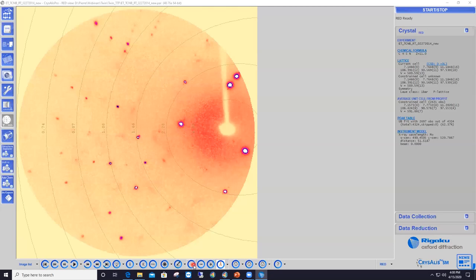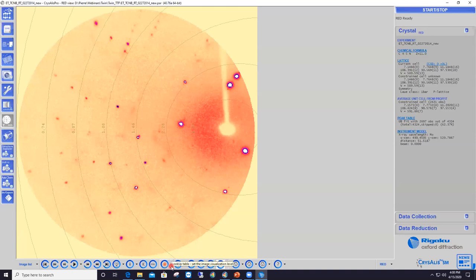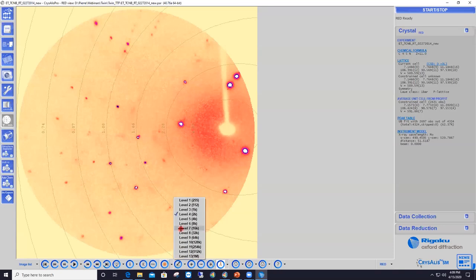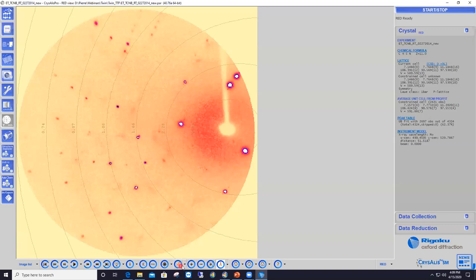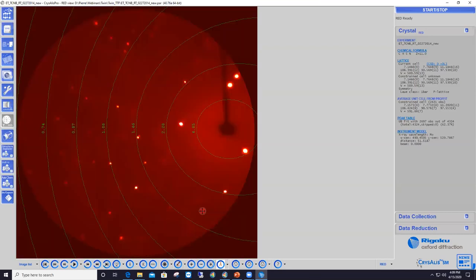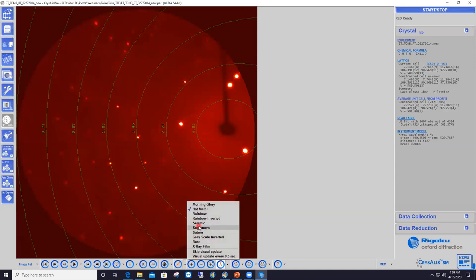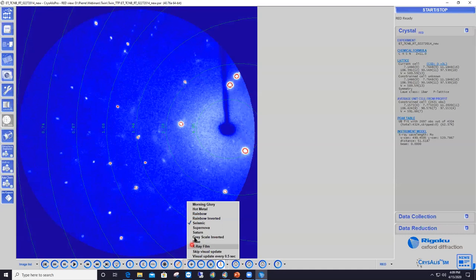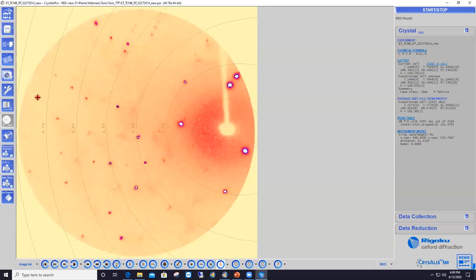You may want to adjust the zoom level using the plus/minus button for a full view of your diffraction image. Adjust the contrast from the starburst button and its pull-down menu. You can also choose a different color scheme from the paintbrush button — some prefer hot metal, but I also like seismic or Saturn, because they allow me to see weaker reflections at higher resolution better.